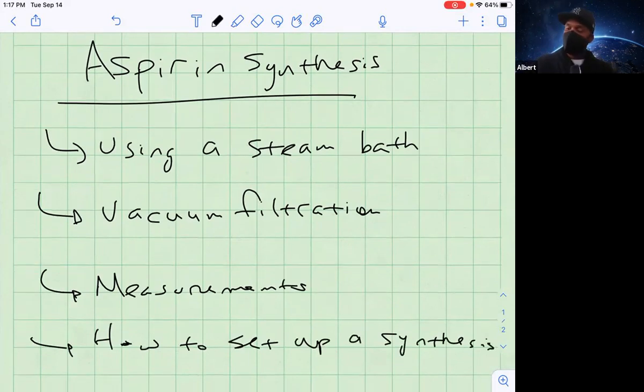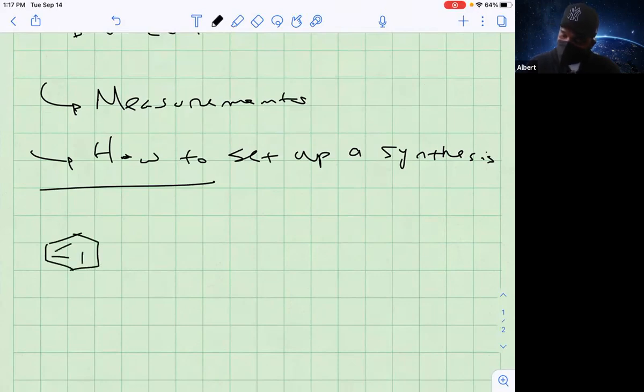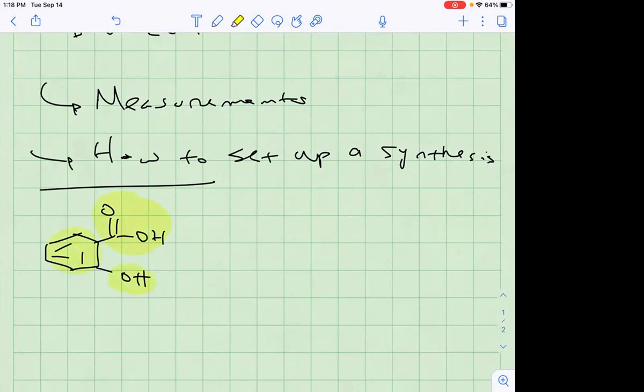All right. So with this aspirin synthesis, if you downloaded the data sheet, the reaction scheme is up top, right? You should have filled out, if you haven't already, you'll have time today, the reagent table. And we're going to actually look this up even before we start. So we're going to take salicylic acid, which looks like this. And for those of you taking part one, again, you can never get away from these functional groups. That's the carboxylic acid, an alcohol, and an aromatic.